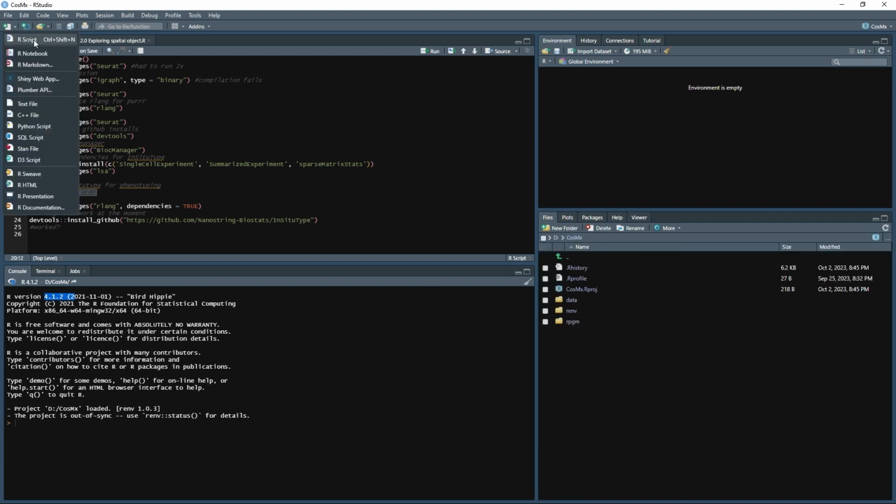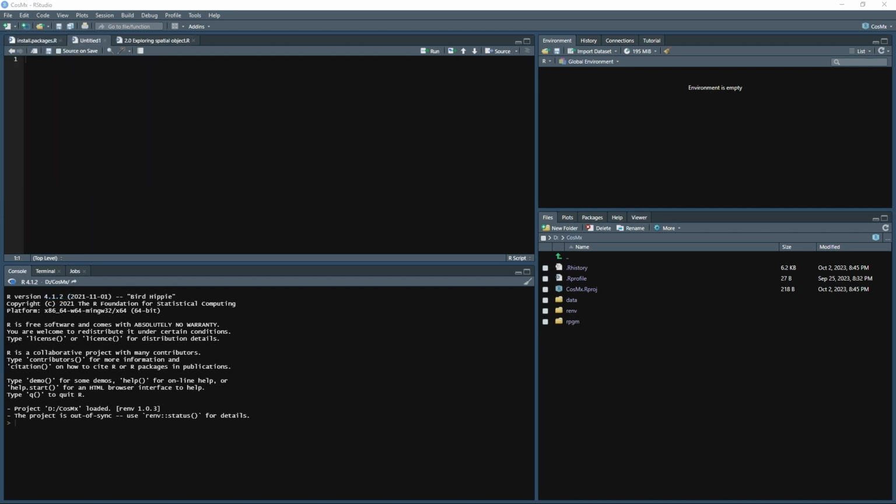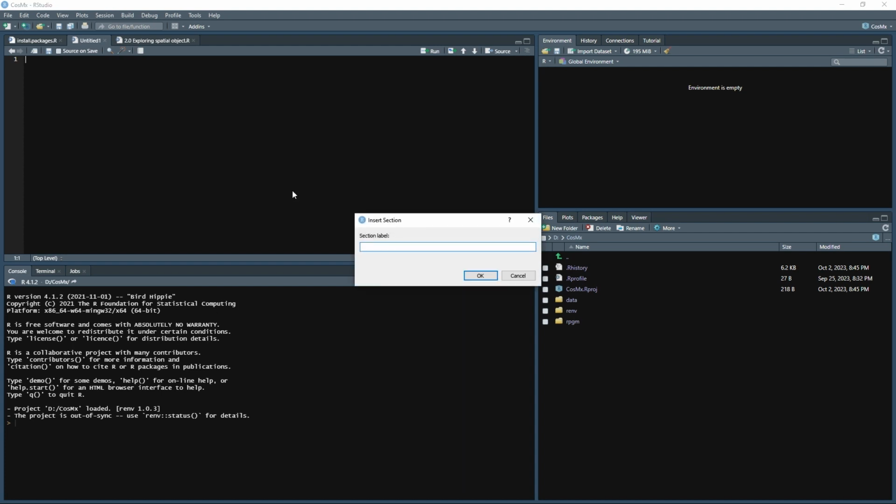But let's go ahead and start with creating a new script. Too much stuff happening. All right. So I think that's the shortcut. We'll do our libraries first.